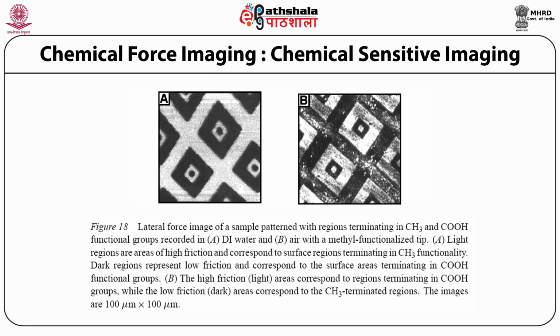Dark regions represent low friction, corresponding to surface areas terminating in COOH acidic functional groups. Part B here shows the high friction, that is the light areas, corresponding to regions terminating in COOH groups, while the low friction, the dark areas, correspond to CH3 terminated regions. The images are 100 micrometers by 100 micrometers in size.